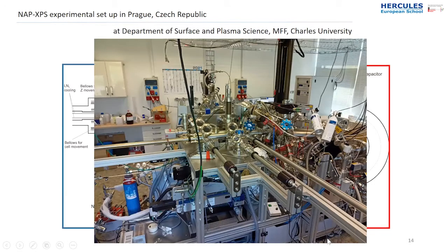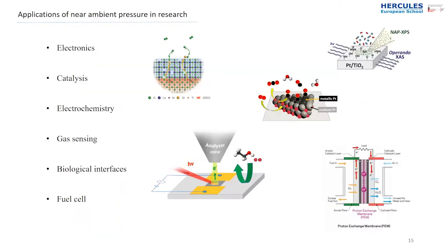This is the recent setup we have, and I will show you soon. So here is the little load lock, a small chamber with small volume that you put a sample in. Here are the doors. We started our experiment already with the sample in. It will be cleaned. So we started by putting it inside the near ambient pressure cell and conducting the experiment with pressurized carbon monoxide at about 1 millibar. Before that, we measured the sample in vacuum for comparison and to see what changes or what adsorbate we actually achieved by this experiment.